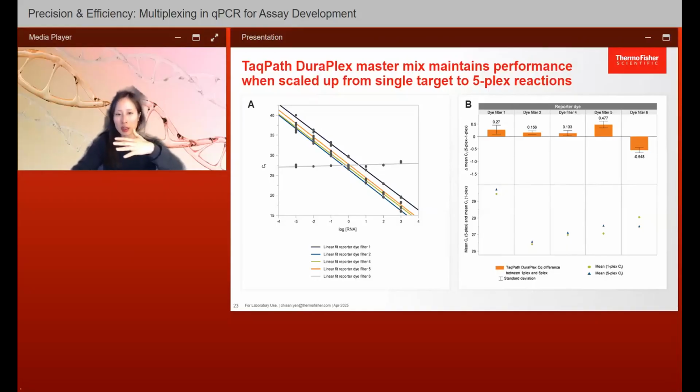Here, this testing is to see if there is interference of amplification of a very high copy target on something that's at a lower concentration. So I kept the IPC at a pretty low input, and the RNA for the 4 other targets ranges from low to high, but you can see that there is no interference at all. The assay performed linearly for each of the targets, and importantly, the target that's kept at one input remained constant throughout the different concentrations of the other template input.